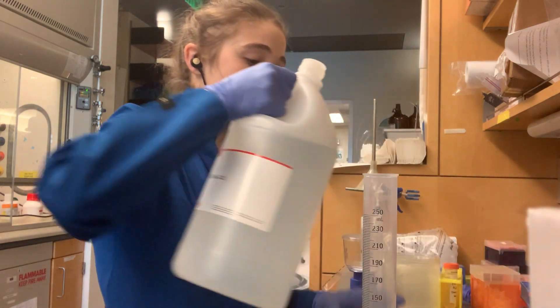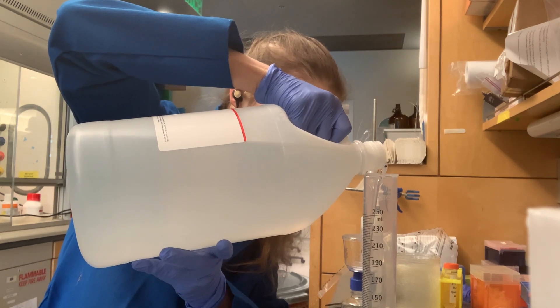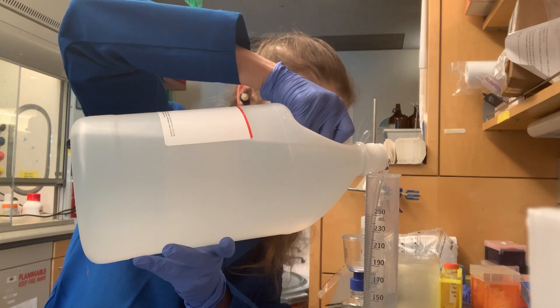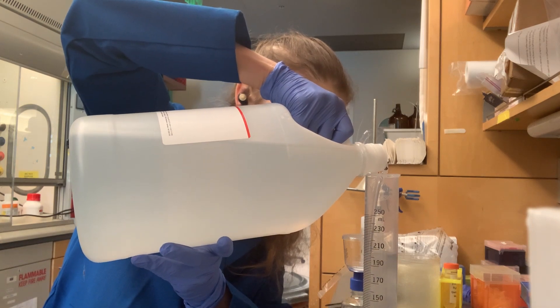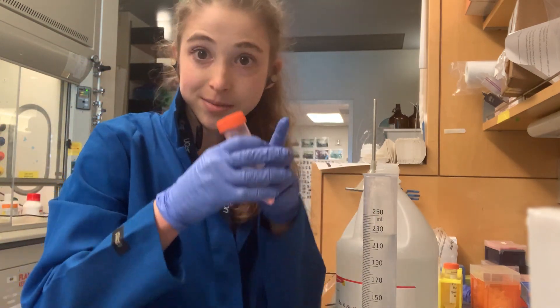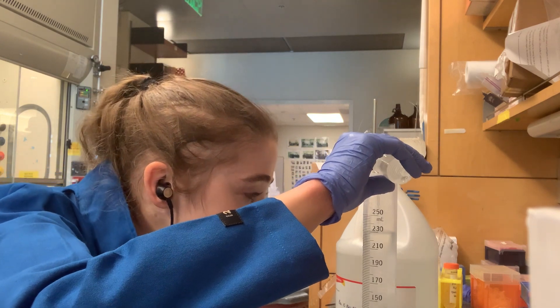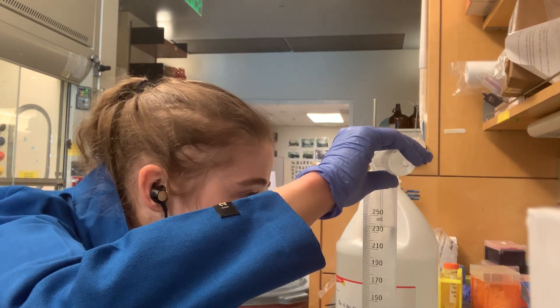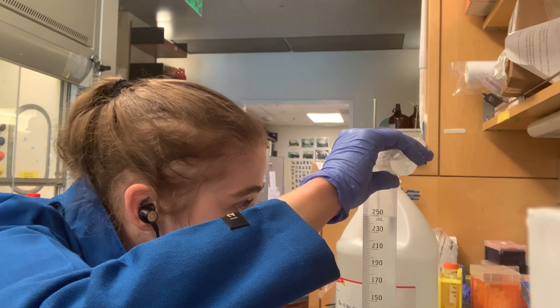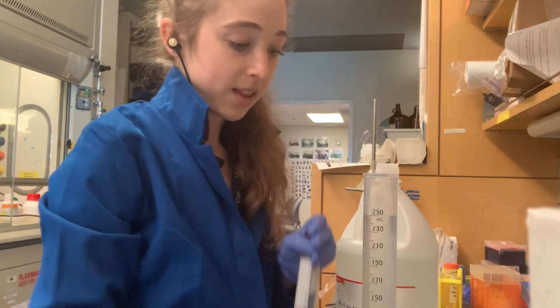I can add the glycerol just by pouring. If you have a really heavy bottle you might want to pour it into something else first, and make sure you try not to get it on the sides of the vessel. When I get close to the target volume, I like to pour from a smaller container for more accuracy. Remember you want to go until the meniscus — the bottom of the smile — is right on the line.